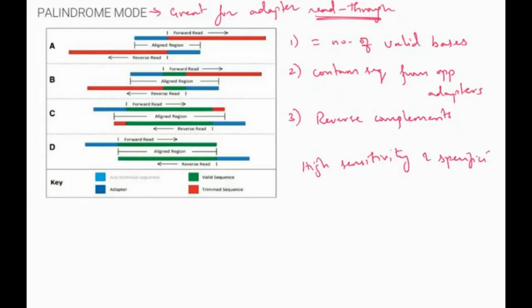The alignment approach is similar to that of the seed and extend in simple mode. Global alignment scoring is used to end-to-end match across the entire overlap. The process begins with an overlap between the adapters and the start of the opposite reads. This alignment would check the read pair for useful sequence information. If there's no such information, which could be caused by direct ligation of adapters, Trimmomatic would drop both the reads.